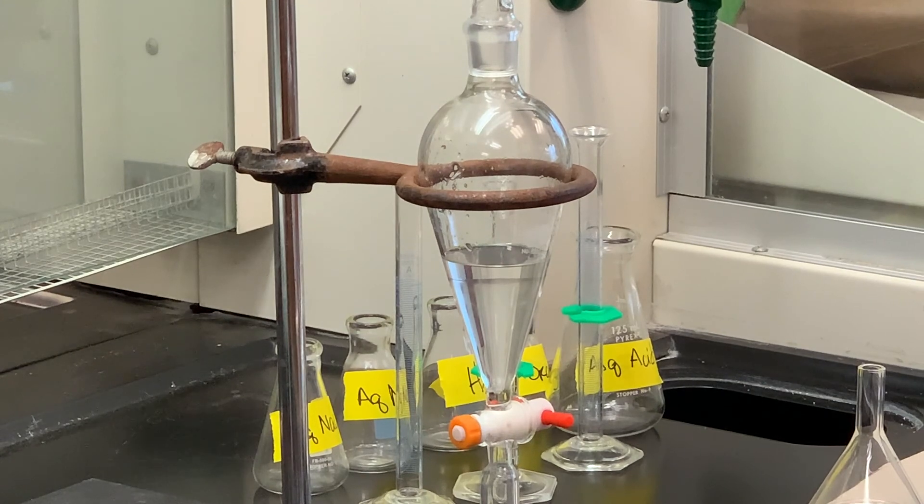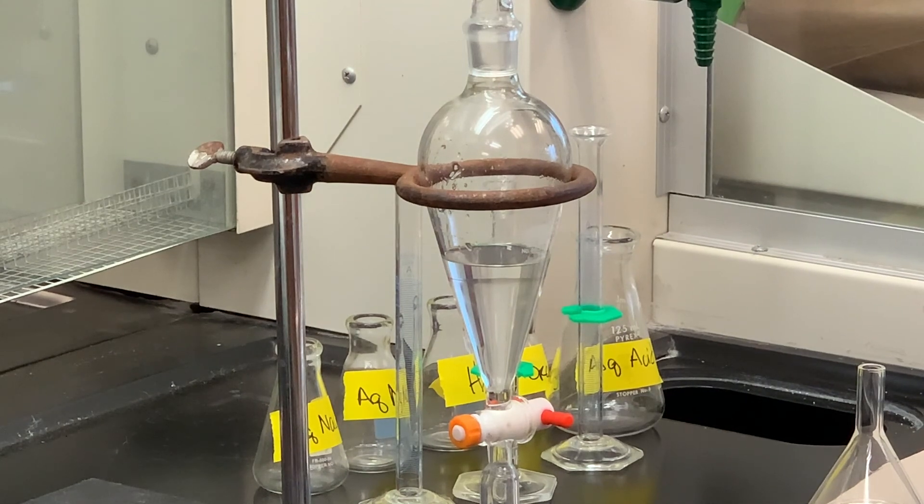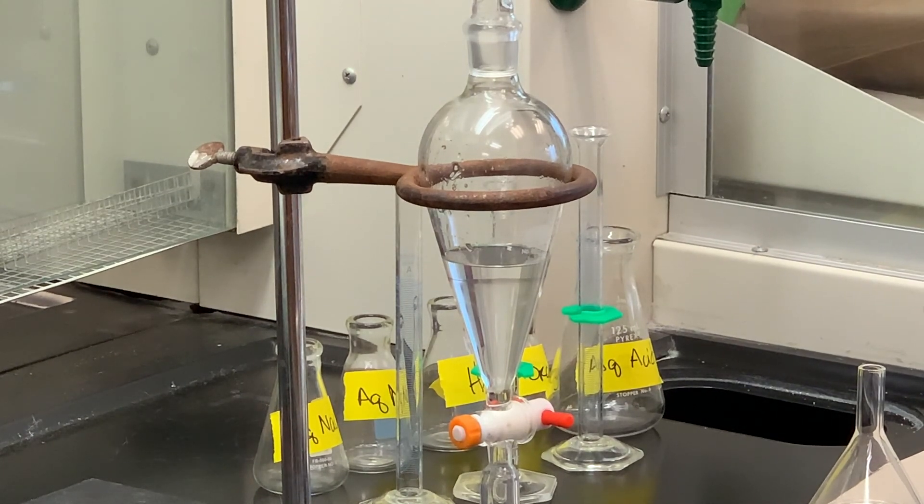The tertiary substrate is very reactive toward the SN1 mechanism. So everything should be converted at this point. But now we have to go through the process and isolate our product. So we've got two layers here.